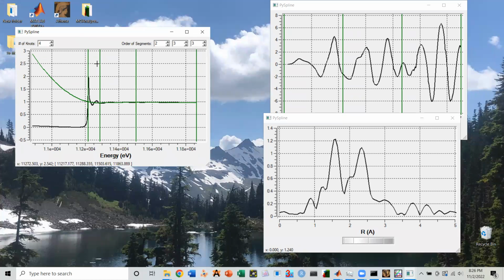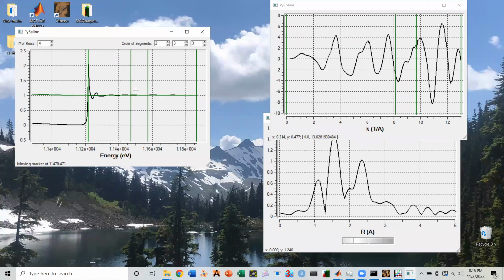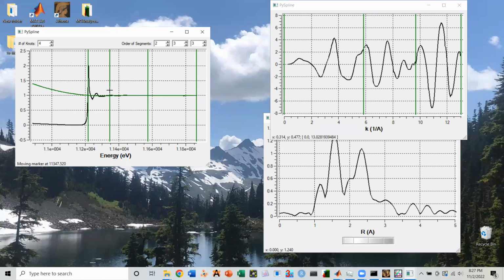So you'll see that the default values for your spline knots, so these lines specify where the knots are in your spline. You'll notice that they were basically evenly spaced in K space. So we still want our end result to be more or less evenly spaced in K space. But of course, we'll have to move them around. We don't want to end up in a situation where we're something like this with 2 of our knots very close together.